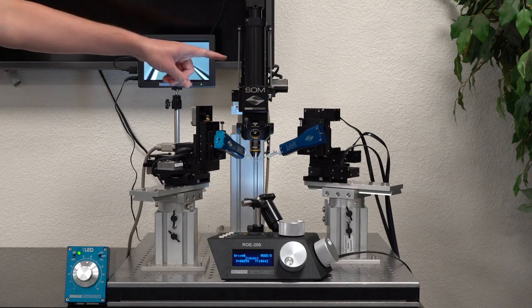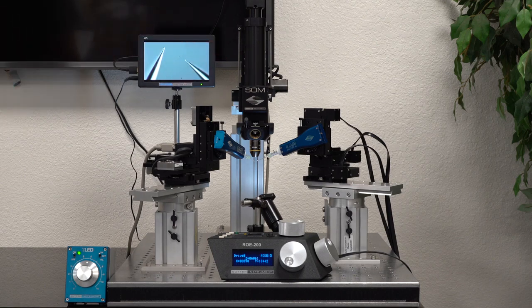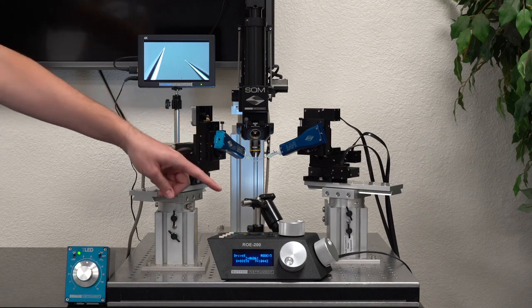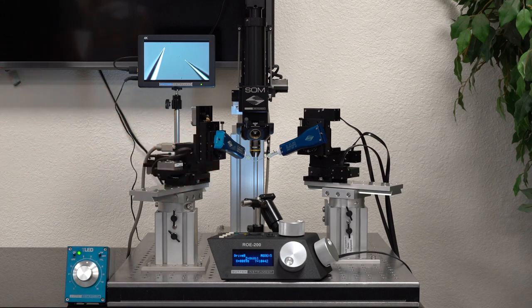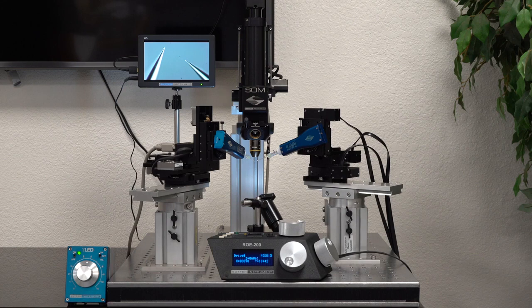With the MP285 mechanical here, the SOM can move the objective 25mm in XYZ using either the manual ROE input device here or via computer commands over USB. The motorized position of the objective allows the specimen to be static.